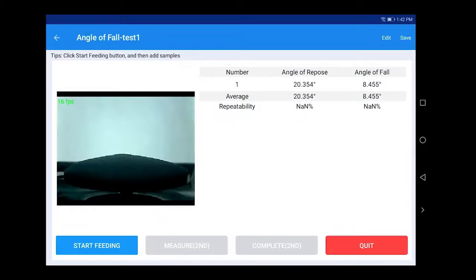Click Complete first, click Save, and click Quit to complete the angle of fall measurement. It is recommended to repeat the test for three times to calculate the average value.